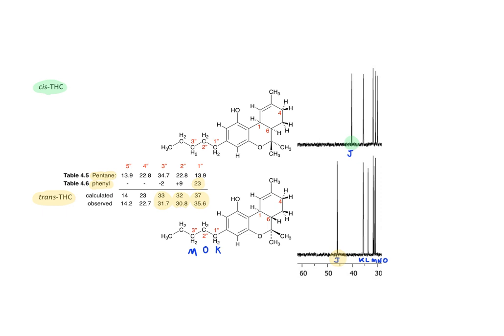These are both unique resonances, so it is possible that it is carbon 6, which is the position where these two compounds have different relative stereochemistry.